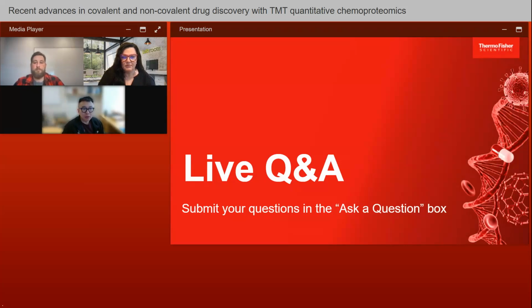If you have the bandwidth and instrument time to run many more fractions, it can solve your problem. I just don't know how much more time you can afford to run those fractions, right, if you're going through many samples. It's a balance between the throughput and how deep you want to go with just a regular discovery, untargeted approach. All right, thank you so much, Qing.